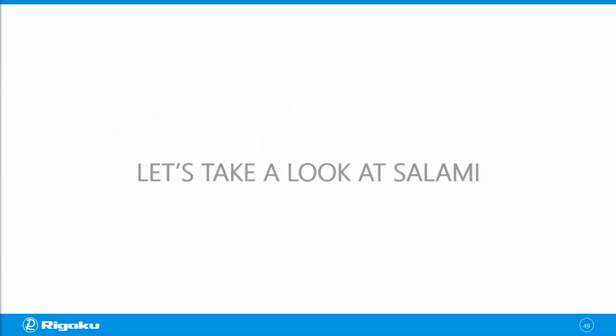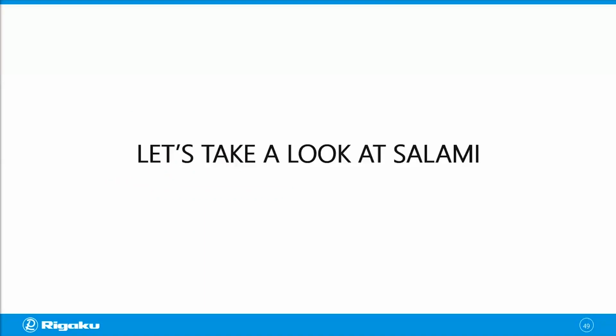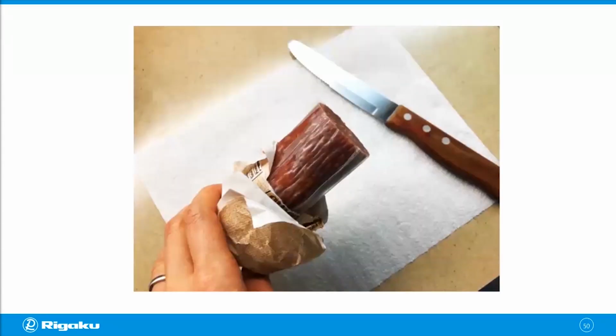So let's say that we want to look at salami. And I would like to walk you through the whole process of picking a sample, setting measurement conditions, doing a scan, and getting some analysis results. So we said that we want to look at salami. And you want to take it out of the fridge. And one of the questions that might come to your mind at this point is, how thick of a slice should I cut? And that's probably one of the many questions that will come to your mind if this is your very first CT scan to run.